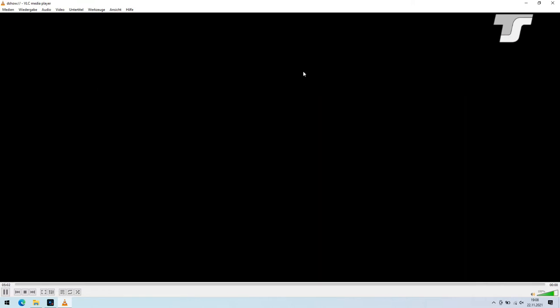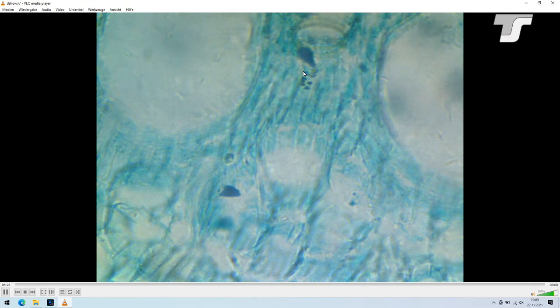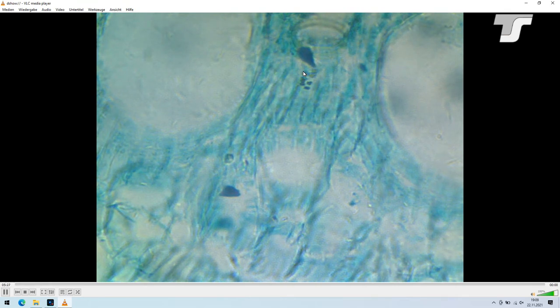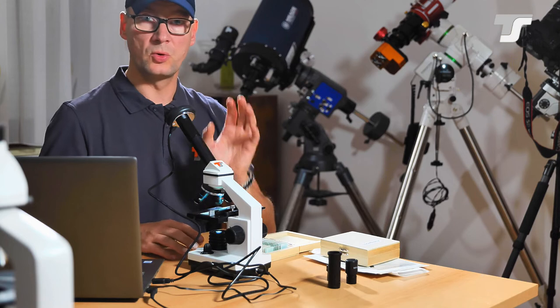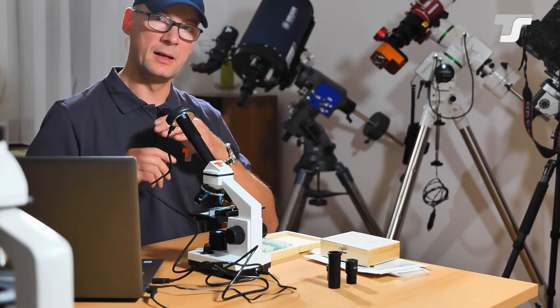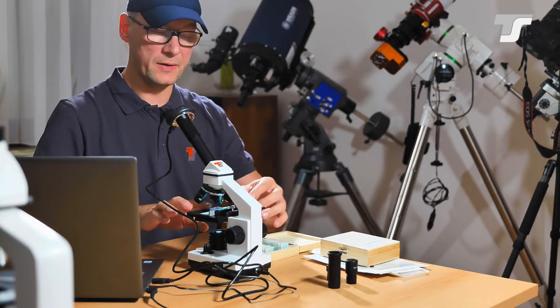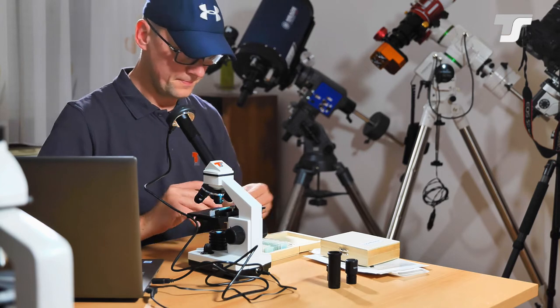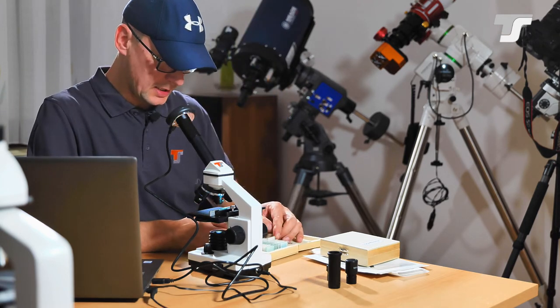And now we go to the maximum just as demonstration. But the bamboo is very transparent so there is not that much contrast in it. But anyway it's a nice subject to explore. I do this really quickly here. Of course when you do it by yourself you can fly through the image and check out all the features that your sample will provide.